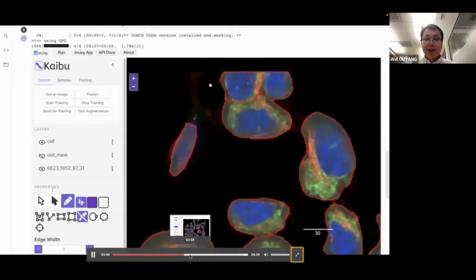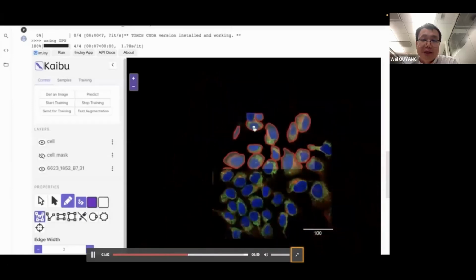The training feature is still under development. That explains why we are still a bit buggy in this process. But the inference should be stable and ready to use, so feel free to try that.